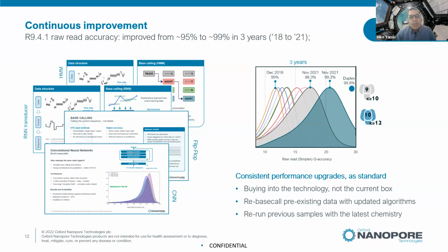And I think we're at the top end where we've finally hit diminishing returns on where the platform needs to be. When Warren and I joined back in 2019, we were updating the base callers quite frequently. I'll just put a note here to educate everyone: when I was selling or supporting PacBio back in 2012, 14, 15, and we were looking at nanopores that emerged with the MinION Access Program in 2014, 15, we saw you got this great little device that you could plug into a laptop, but you got a bunch of Ns and then just a base, and then a bunch of Ns and then a base.